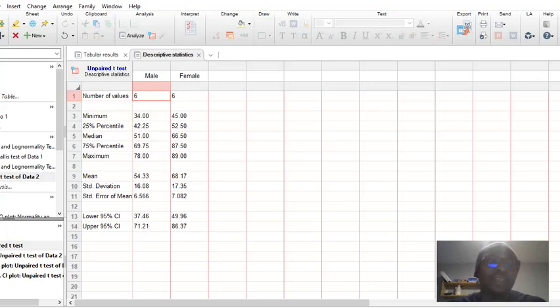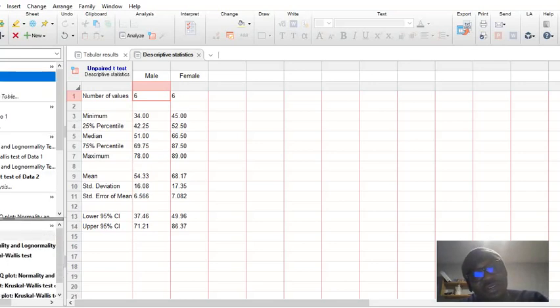That is that for today. I hope that next time I'll be able to go deeper to show you how to run a straight line graph to determine the concentration and also to get your R values out of the straight line graph.